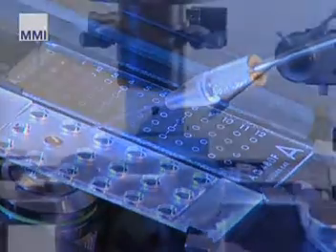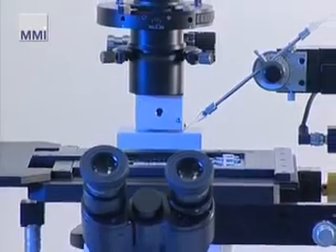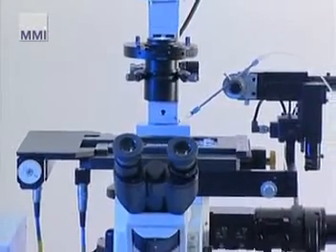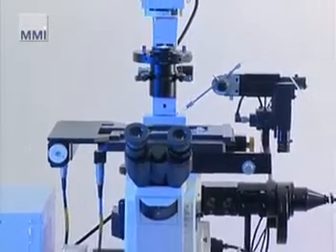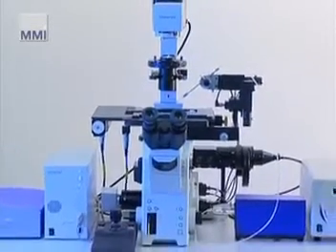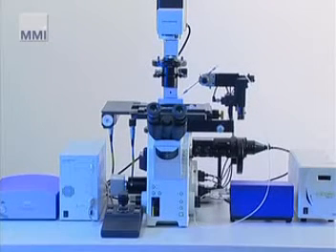The selector is an adjustable and open platform for any assay format. It closes the technical gap between frequent and rare cell sorting in cancer research, immunology, stem cell sciences, and many other disciplines of biomedical research and cellular diagnostics.